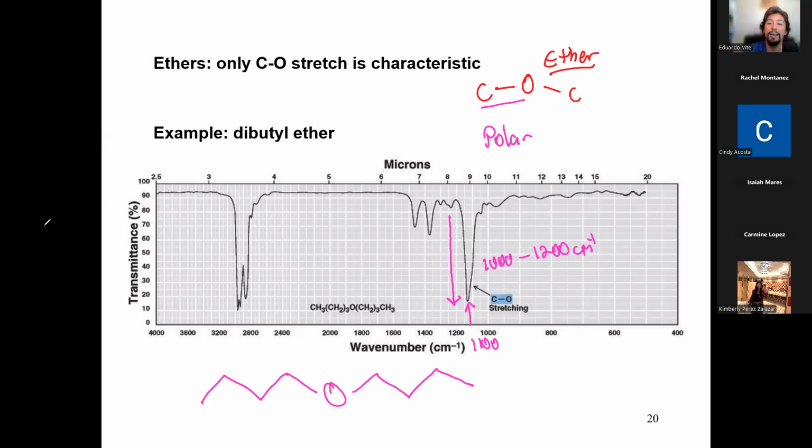And that's also why in the OH, in the hydroxide, this peak will show up, but it could still be an ether. Just that peak doesn't confirm it's an alcohol. So it's good to see, but in that case, it's not very useful. Here, we don't have an OH peak, so we know that CO cannot be an alcohol or a phenol. It has to be something else. So that's why it's useful. What are these peaks right here in the red? Somebody tell me. What are those peaks right here?